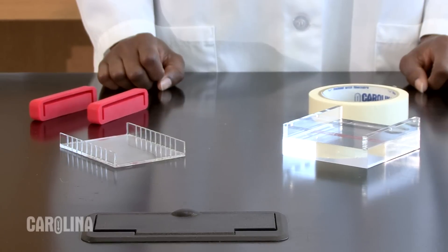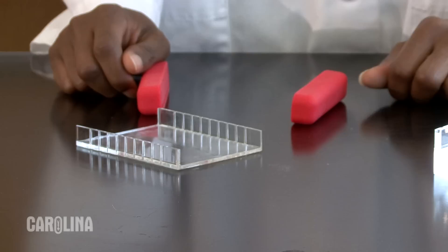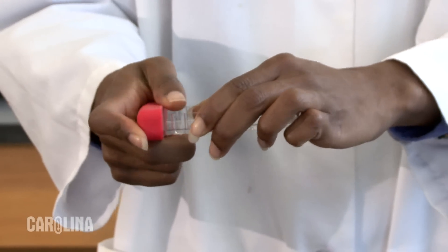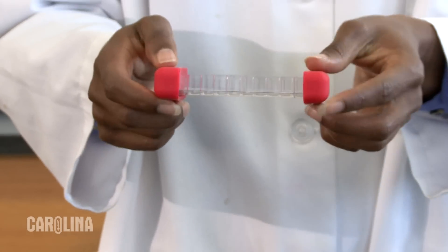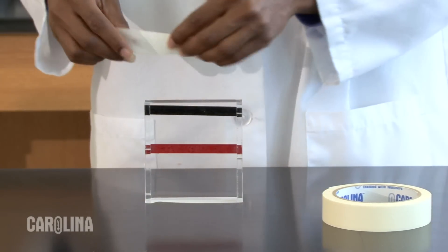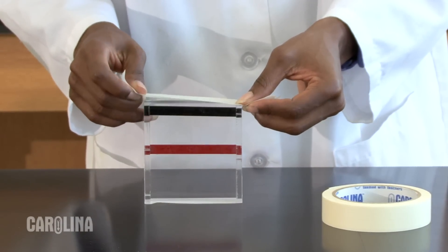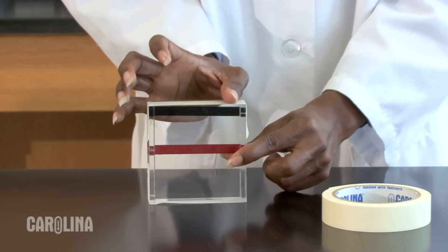Avoid pouring the agarose gel while the solution is still very hot — this will extend the life of your gel trays. The ends of the gel tray are open and must be sealed before the gel can be poured. Some gel trays come with gates or dams for doing this. The dams that come with this gel tray fit tightly over the end of the tray. Some trays are sealed with masking tape. When sealing with masking tape, make sure you use good quality tape that is not many years old, otherwise it will not seal well. Run your thumb along the edge of the gel tray to make sure the tape is stuck well.